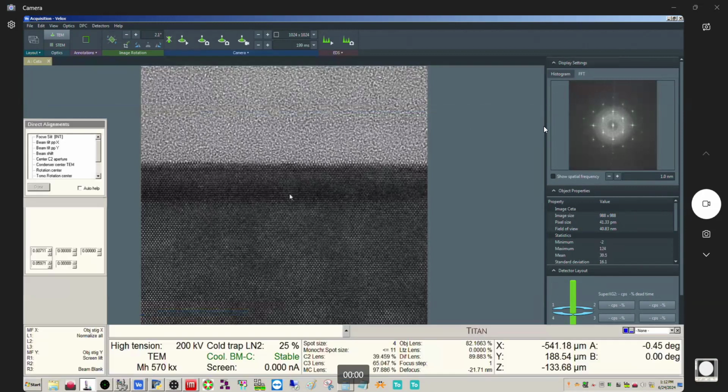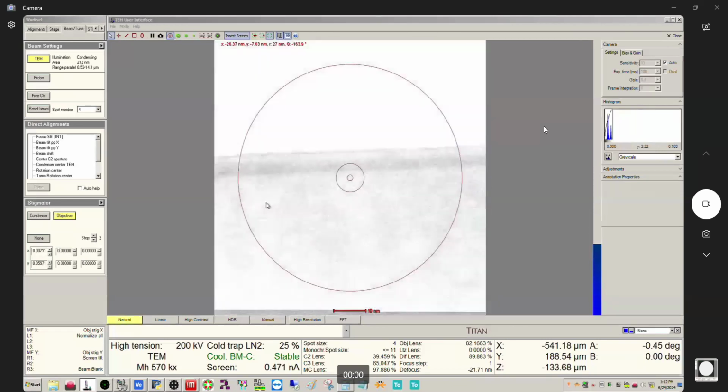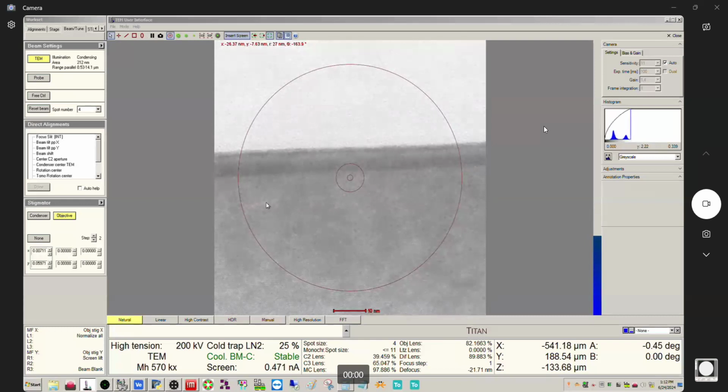All right. So that is the second video that I wanted to do today, and that is covering coma-free axis alignment, otherwise known as coma-free axis alignment to some of you. And I, of course, respect your choice of language there, okay?